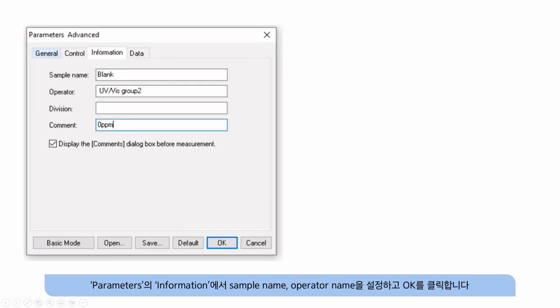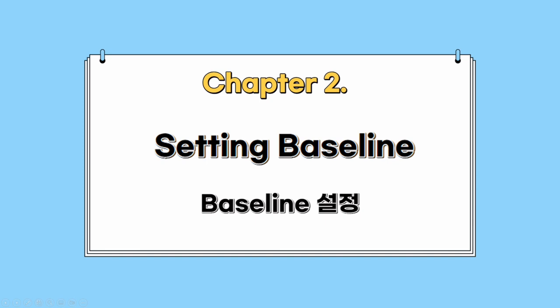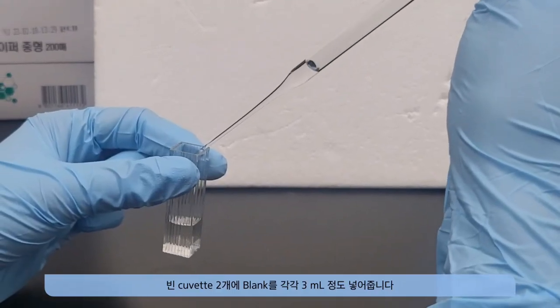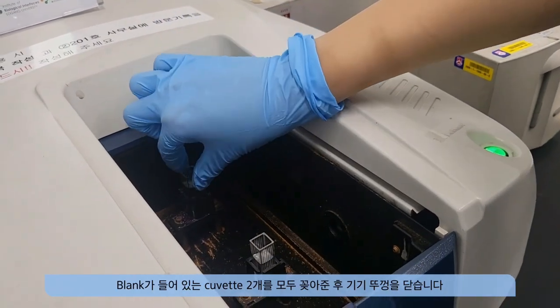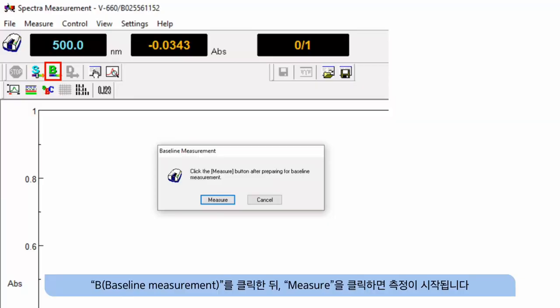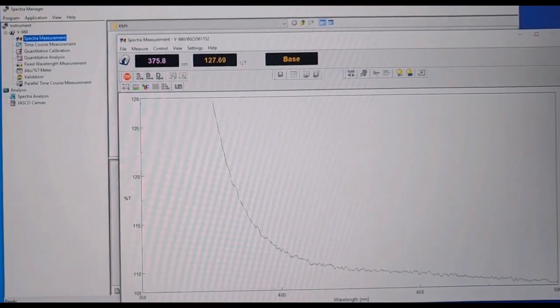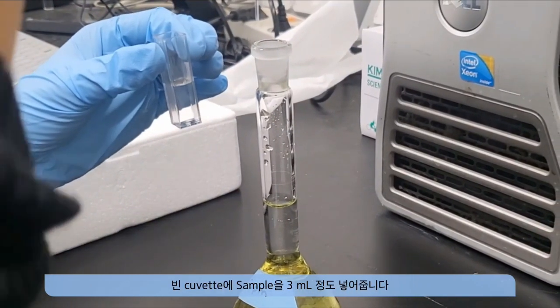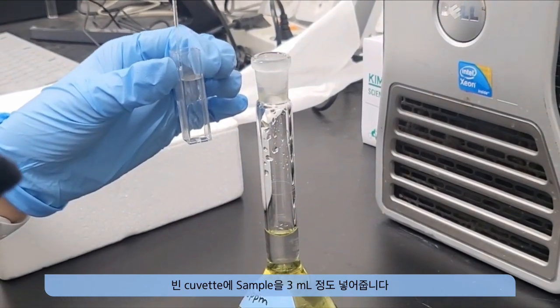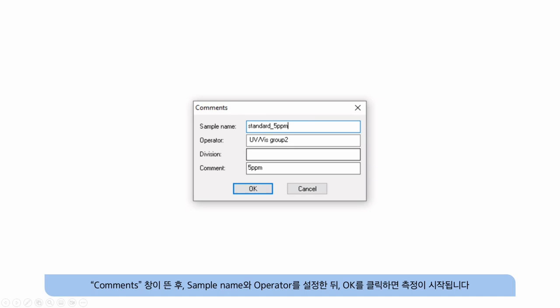In the information section of the parameters, set the sample name and operator name, then click OK. Put about 3 ml of blank solution into each of two empty cuvettes. Place the cuvette with the transparent side facing the lamp and close the lid. After clicking baseline measurement, click measure to start the measurement. Put about 3 ml of sample into an empty cuvette, keep the inside cuvette in place, and set the sample in the outer slot. Click sample measurement, and when the comments window appears, set the sample name and click OK to start measurement.